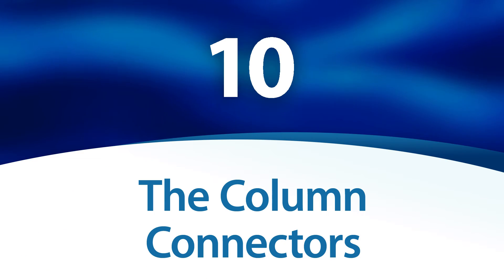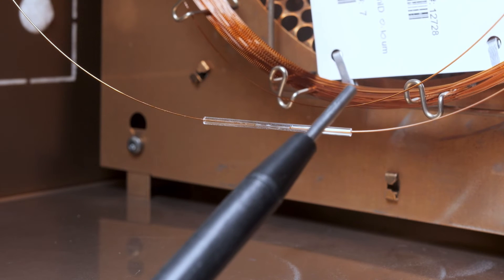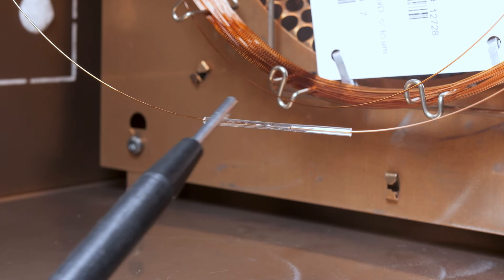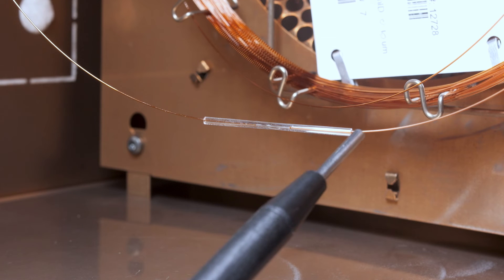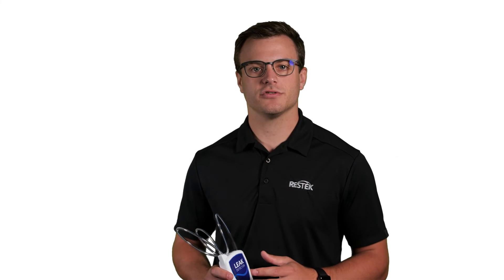The column connectors. Don't forget the column — column connectors are common sources for leaks, even if they are leak-free after initial installation. Check them regularly during use. Reinstallation may be necessary if you discover a leak. Even if a leak is not detected at any of these spots, it is good practice to inspect and leak-check your gas lines and instrument daily, paying close attention to critical seals.